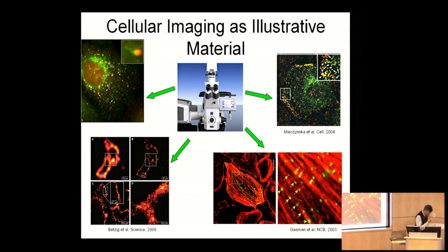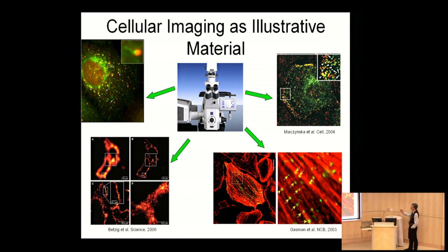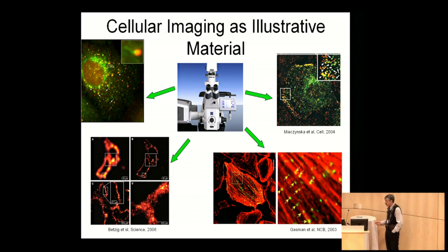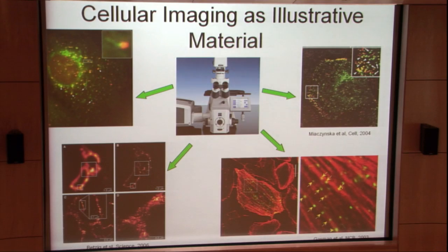So for a long time, cellular visualization and microscopy was, in a sense, descriptive. And up to now, the descriptive part is very essential. In many papers, you find images where people just show with small arrows, look, this on this here. Or even if you go to super resolution microscopy, mostly this just represents.